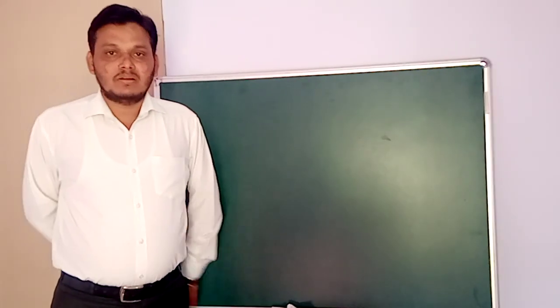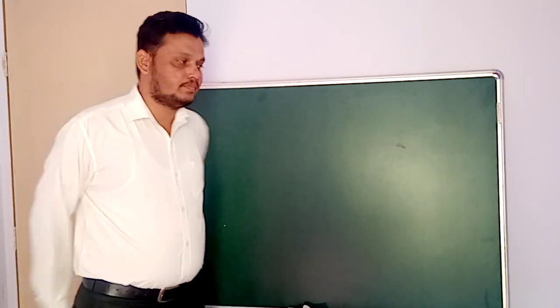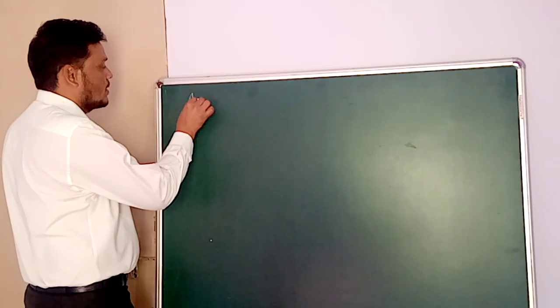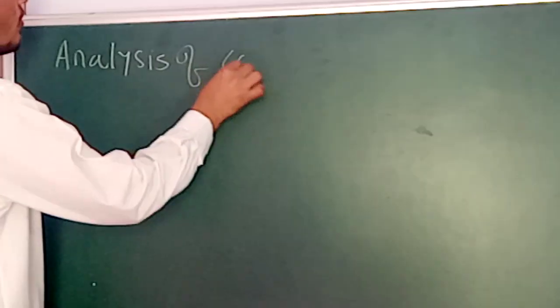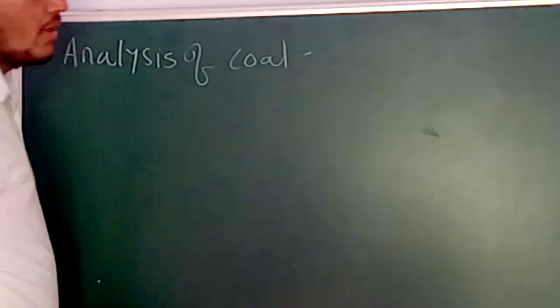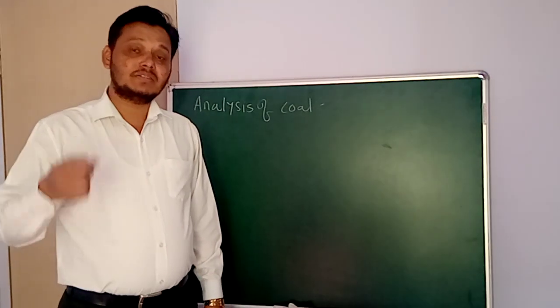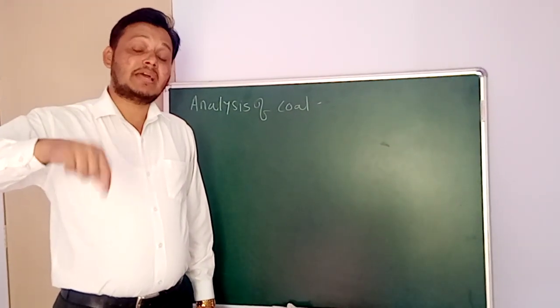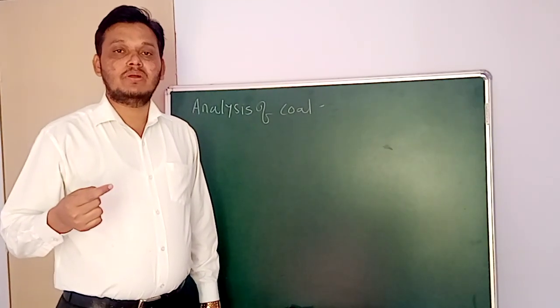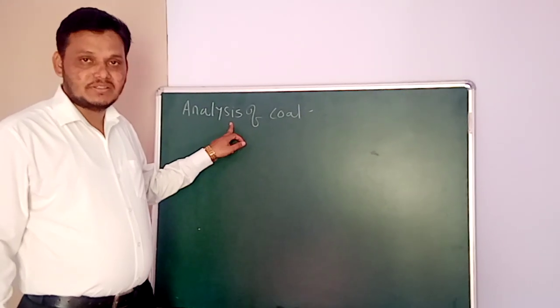Welcome back. Let's begin with today's new topic, that is analysis of coal. Analysis of coal is very important because it can determine the various constituents present in the coal sample, because those constituents directly affect the calorific value of the coal sample. That's why the analysis of coal is very essential, right?